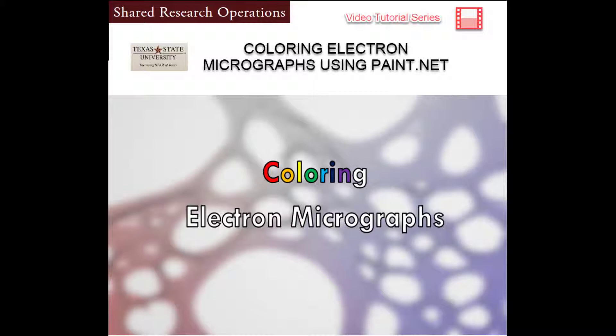In this video, we will demonstrate how to create false color electron micrographs using Paint.NET.